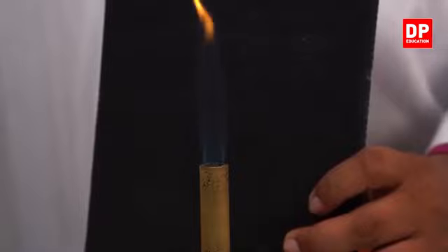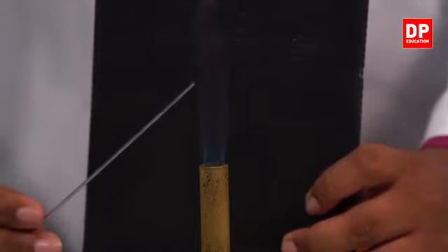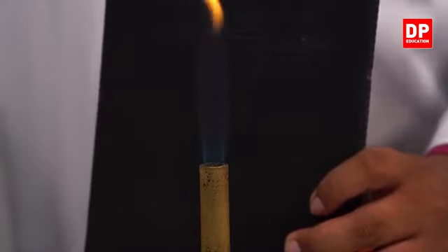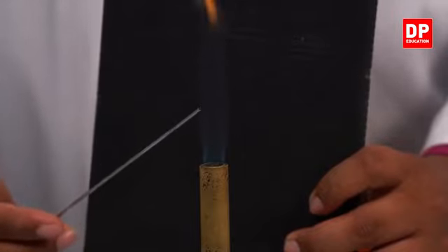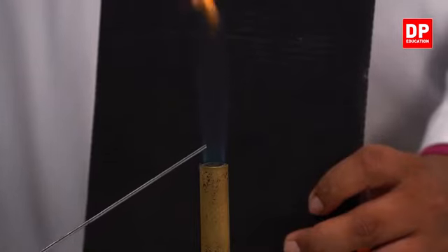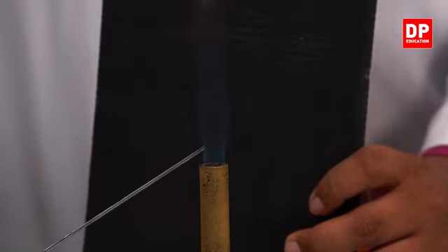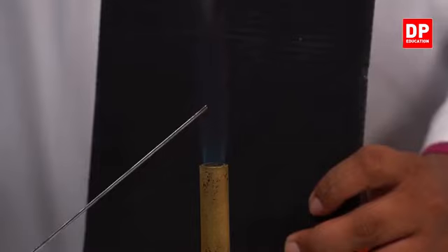The invisible zone. Then the second zone, in here, you can observe the light blue area. It's somewhat light blue. If you compare the colors between this area and this area, here you can observe a dark blue color, and here you can observe a light blue color.